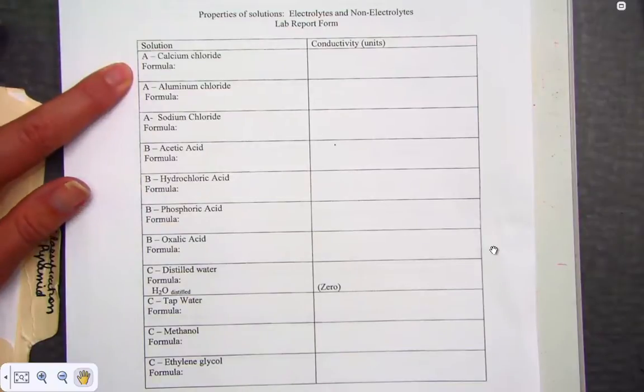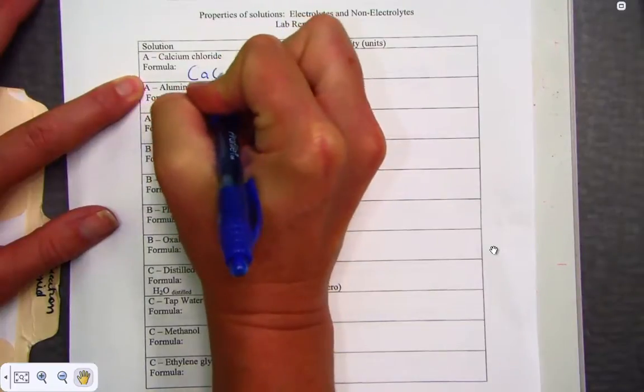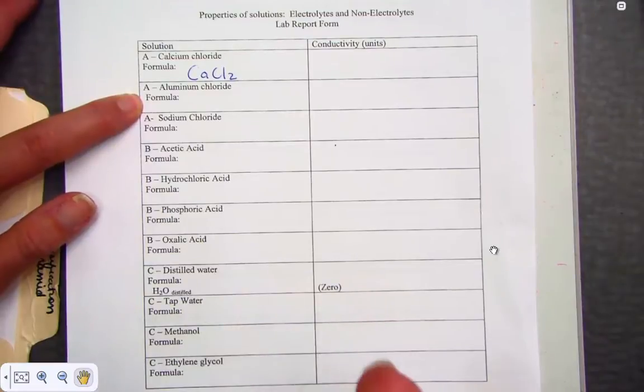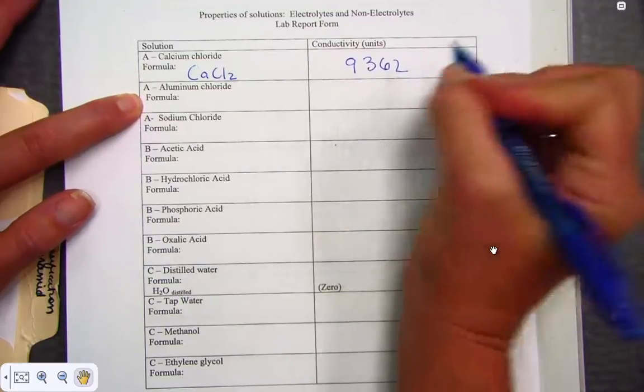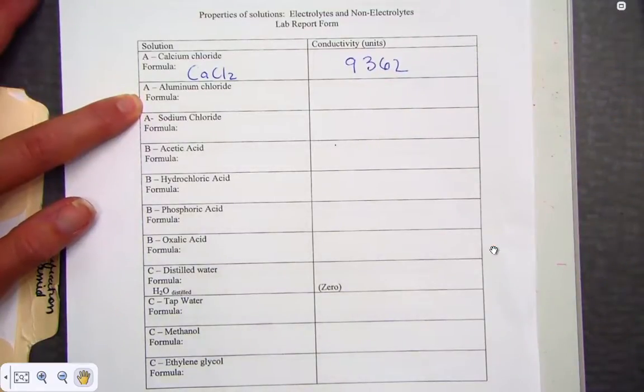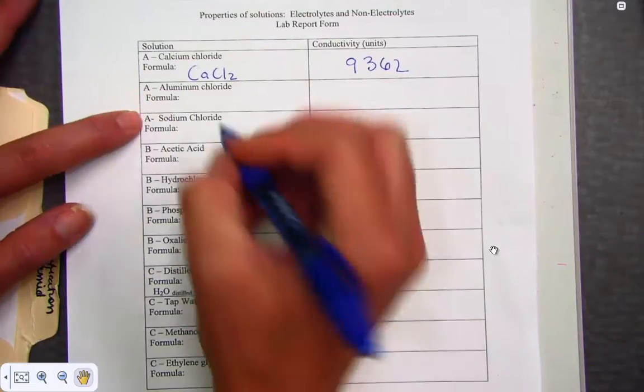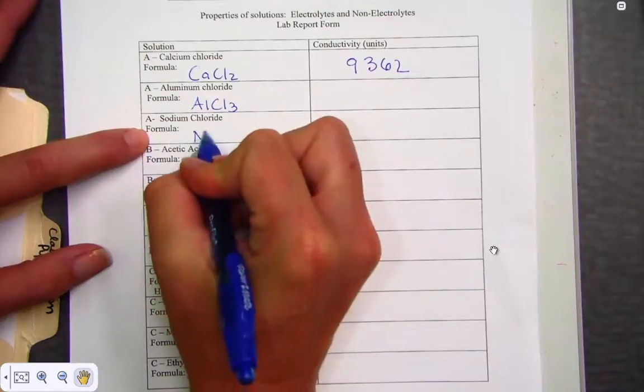When I take a look at the solutions from part A, the first one, calcium chloride, CaCl2. When we place the conductivity meter, and I'm giving you approximate values. When I conducted the experiment, I saw a value of about 9,362. I'm not asking you to change what you saw. Each conductivity meter is going to give us a unique value. They were not calibrated for each other. But all we're looking to do is to compare the values from one meter to the next. We placed aluminum chloride, AlCl3, and sodium chloride, NaCl.